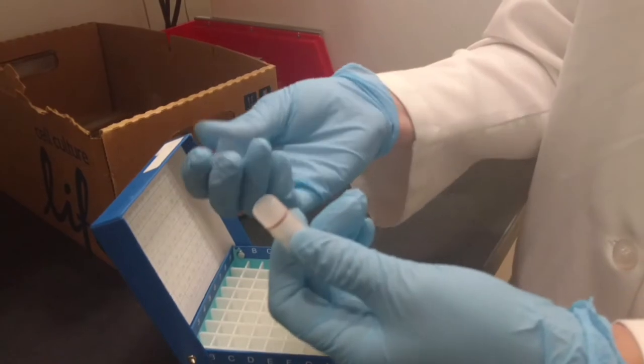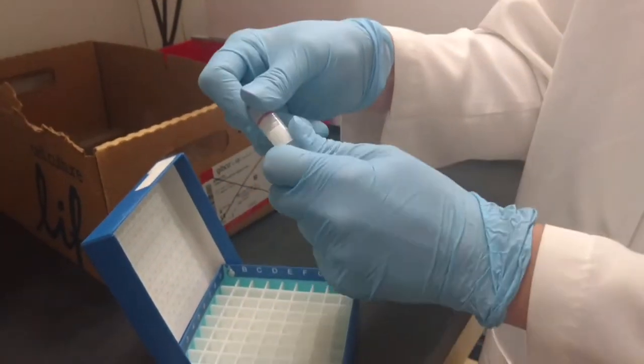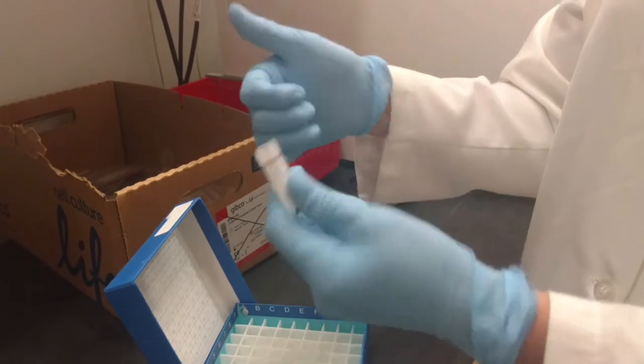Now you can remove the plastic overwrap and dispose of it, and your cryovial is now ready to be opened.